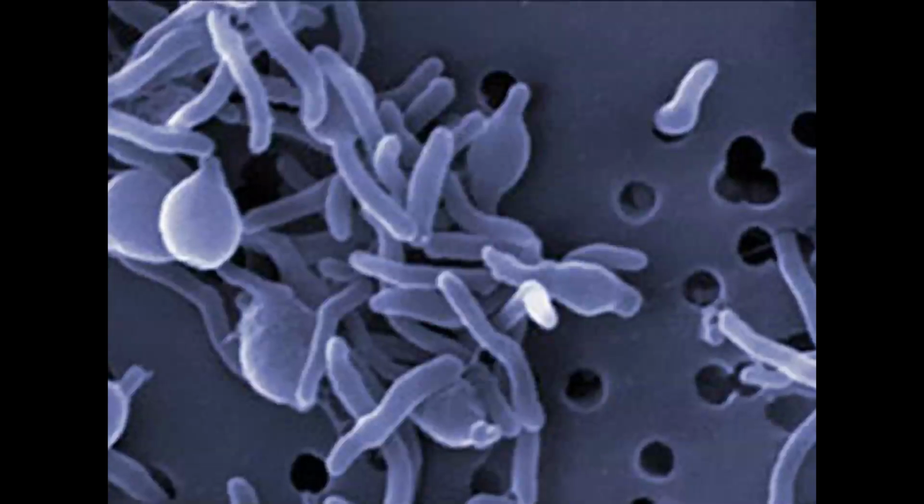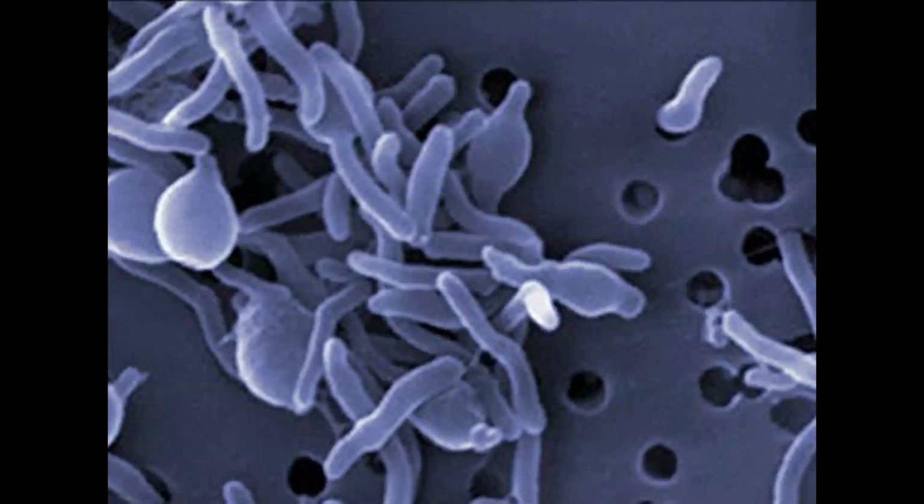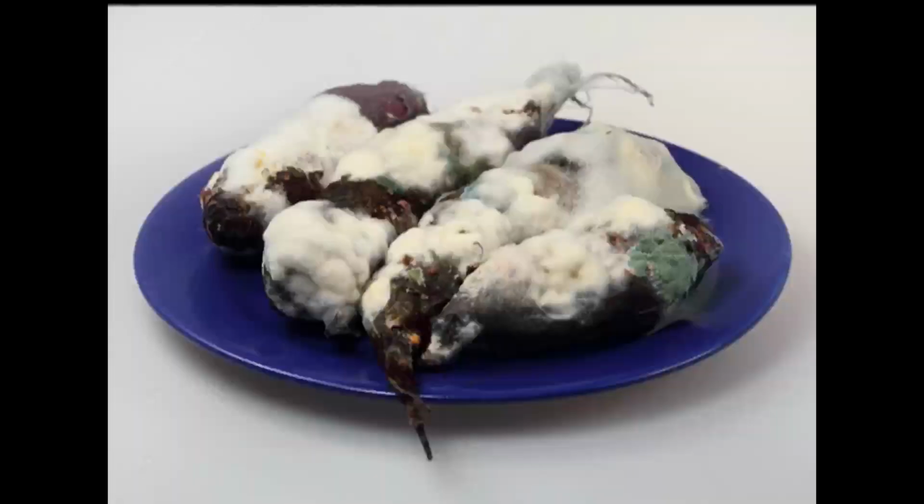So, the study of sterilization or antimicrobial control agents is of immense practical importance from the viewpoint of human health. Though we all know that microbes are helpful to us, most of them are beneficial, but still there are certain microbes which are responsible for causing diseases. On the other hand, there are certain microbes which are responsible for spoilage of food.